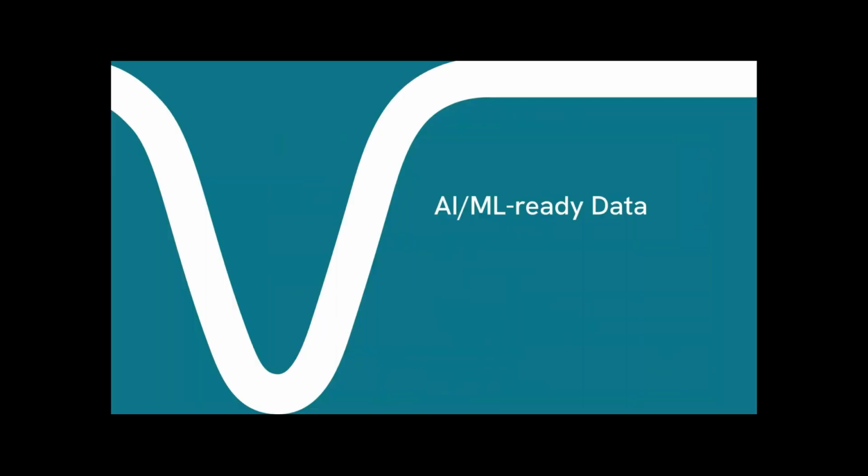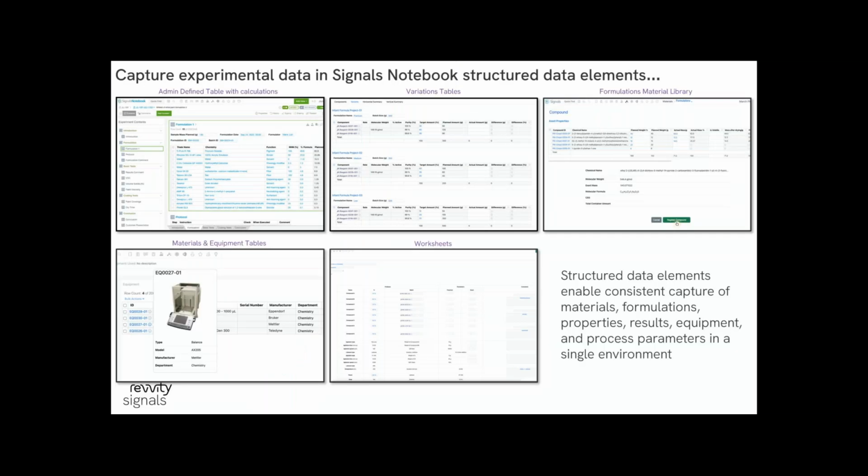Yeah, so I think it's a really excellent point. Without connecting the data in a structured way for comparison or harmonization, all of what we've shown is a little bit pointless. It's in a silo. So let's talk about what happens when all of these results, whether they're coming from high content screening or high throughput techniques, our instruments or third-party platforms, all this data needs to be centralized or at least connected.